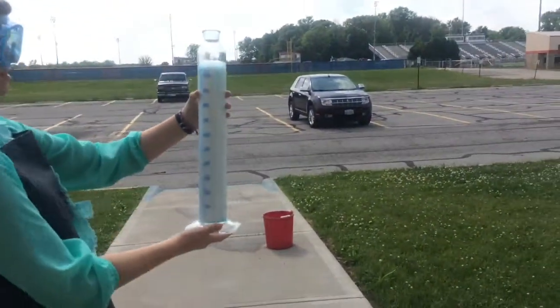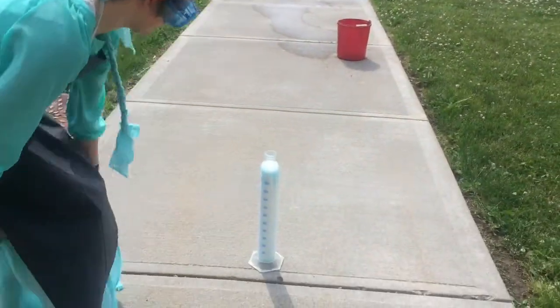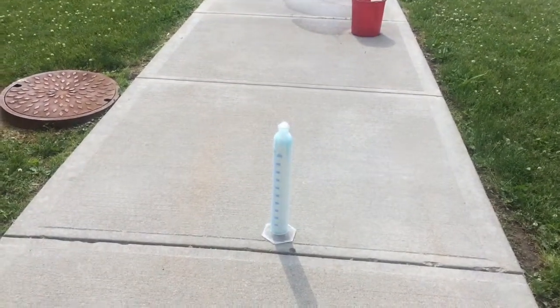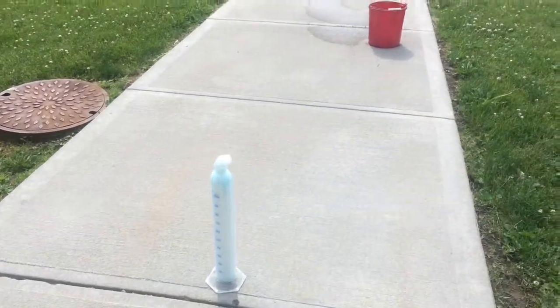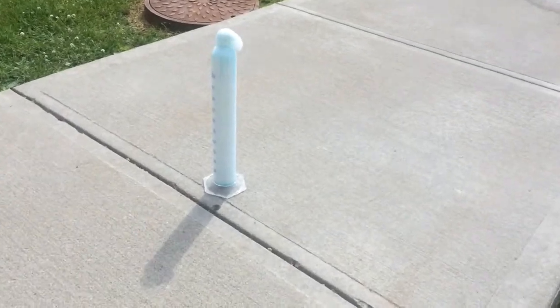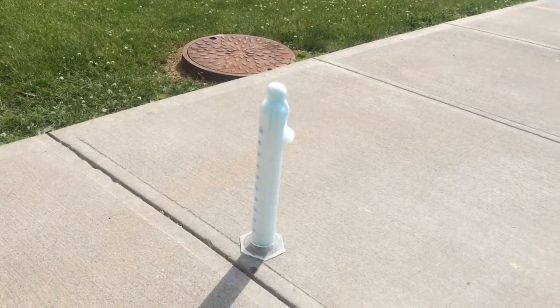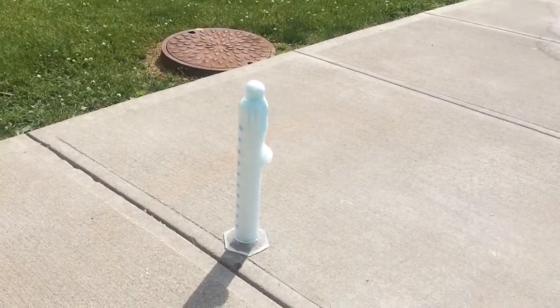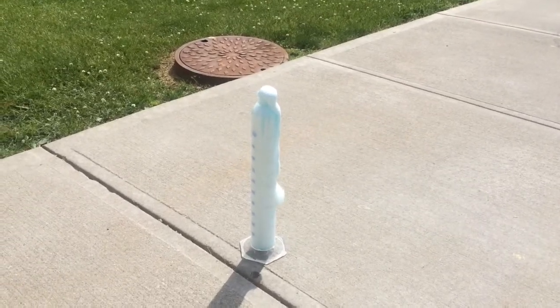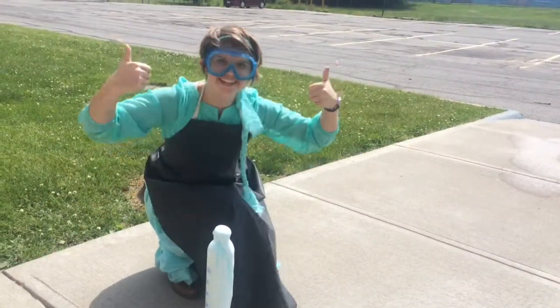So as you can see, it is well over the liter mark, and I don't want to get burned or anything, so I'm going to set that down. Oh my gosh. This myth has been proved.